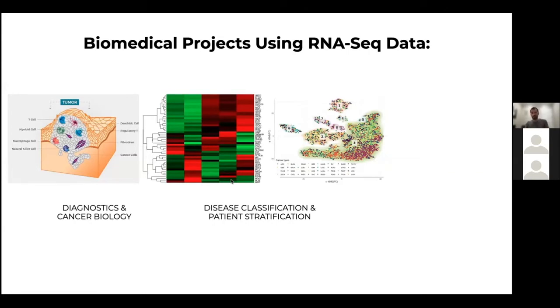So when you look at microarray data, instead of 23,000, you actually see that it's like 60,000. So why is that? Because you can represent each gene by multiple transcripts. And there are some transcripts that are known transcripts. And we'll actually talk about this in a few minutes when we do a practical hands-on assignment. So you will see that a lot of times the microarray design includes known variation in order for a person who is analyzing that data to capture all the variation that is present. But since we don't know all of the possible variations, we are likely to miss some of them, because if we want to include all of the possible variations, it's just going to become too many things to measure. So that's really the answer to your question.